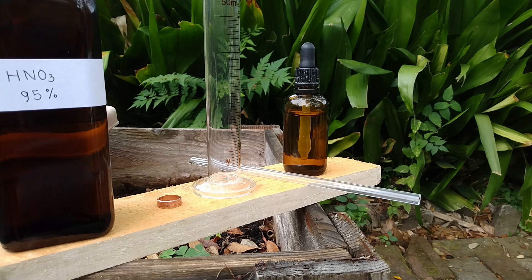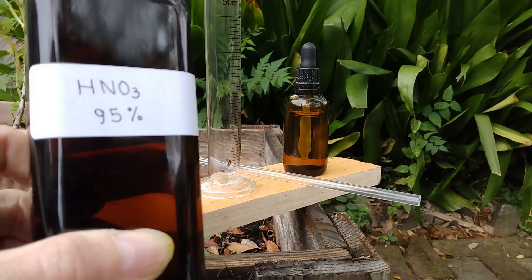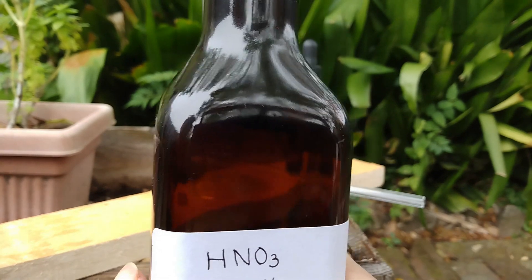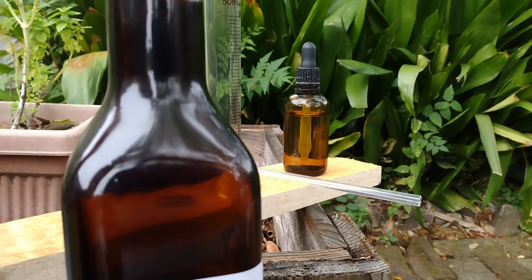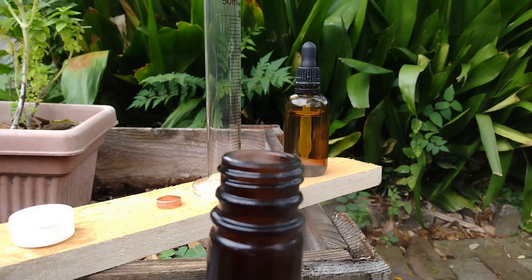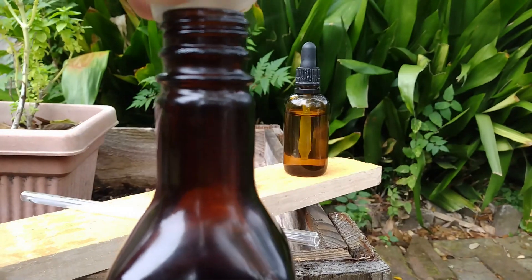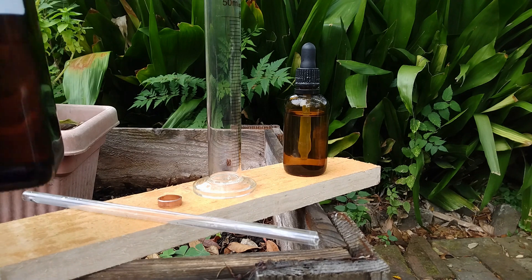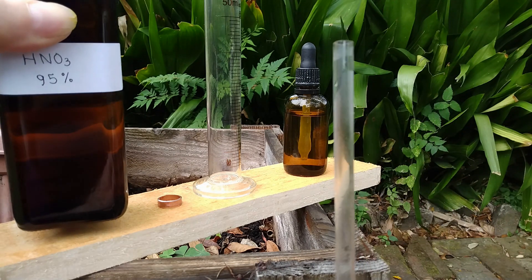Now what is also special about this acid, which I made myself, is that it has 95% concentration. Usually the nitric acid you can buy online is called concentrated nitric acid, which means it has a concentration of 70%. What happens when you have such a high concentration — as you can see — is that when you blow on it, it fumes. This is called white fuming nitric acid, and the fact that the fumes are white is an indication that the concentration is at least 90%.